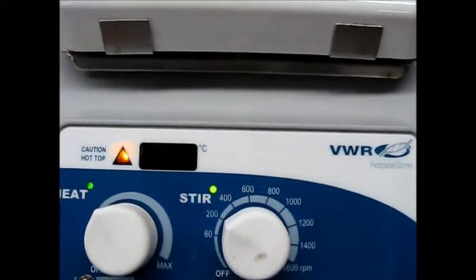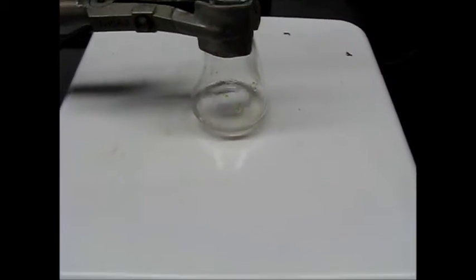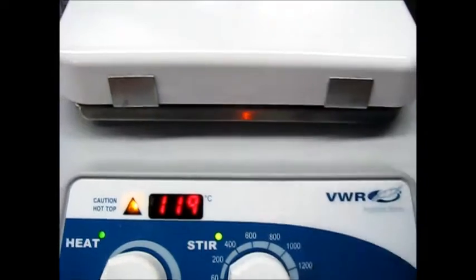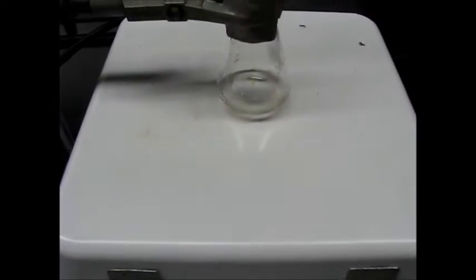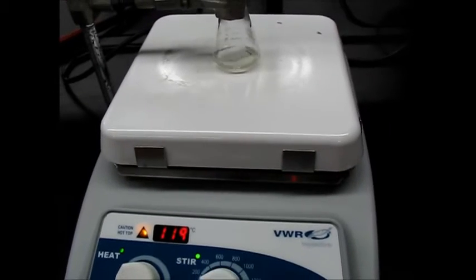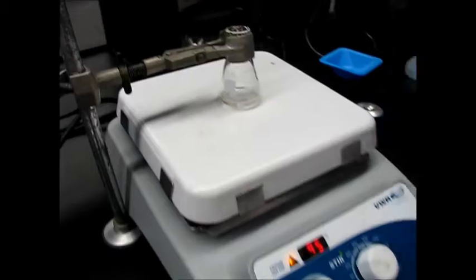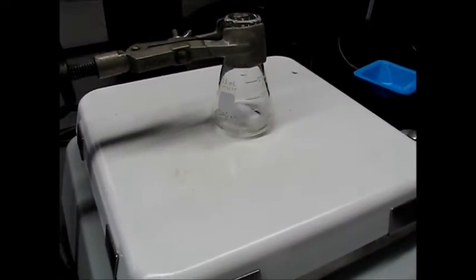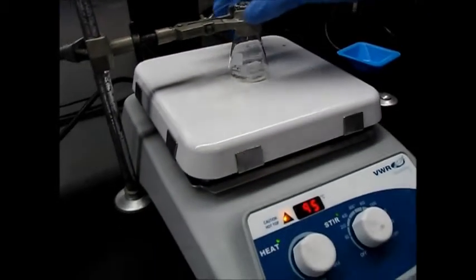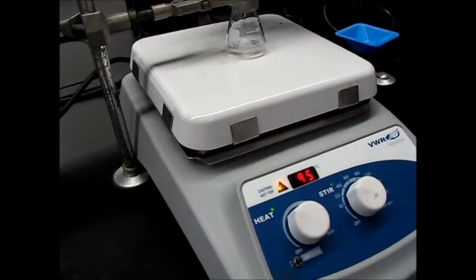This reaction is fast, and here you can see it changes the color within 2 minutes, and heat is still on. Alright, so we've let it stir for about 5 or 6 minutes now. So it's completely colorless, as you can see, so that means that all of the 9-fluorenone is out of solution.